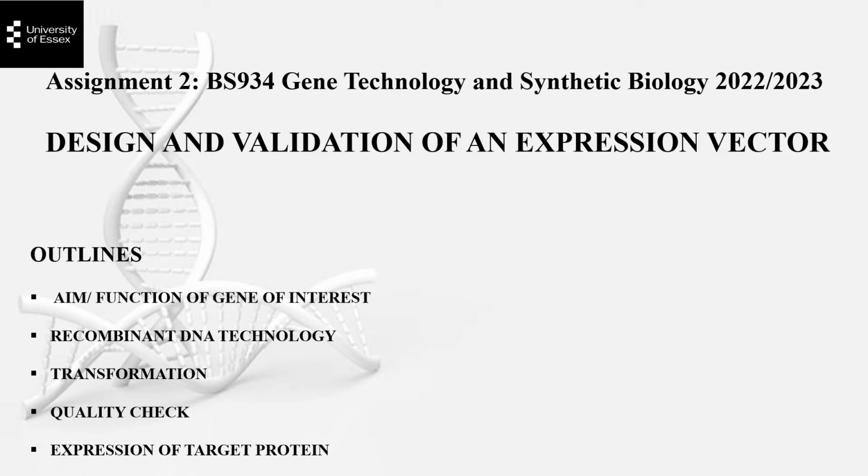This is an oral presentation on the design and validation of an expression vector. These are the outlines. I'll be talking about the function of my gene of interest, the recombinant DNA technology, the transformation, the quality check, and the expression of my target protein.